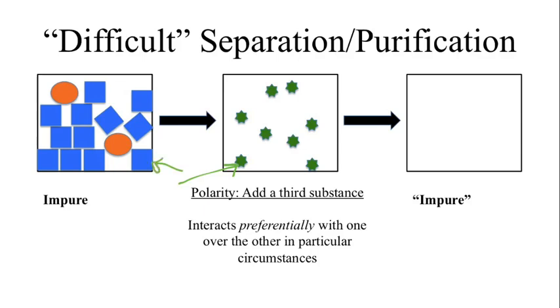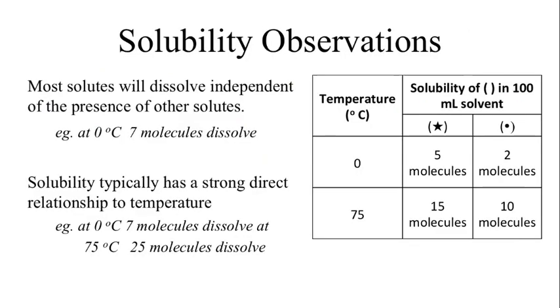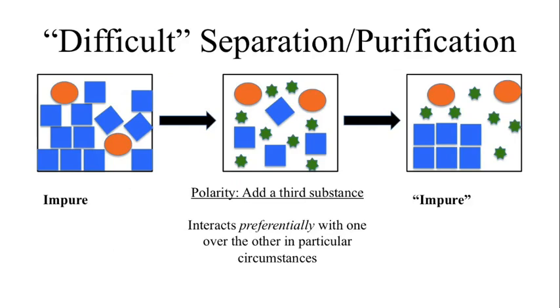Okay, so it's got to be able to come in and pull each of those molecules out away from each other entirely. Okay, once they're all separated, we then need to be able to somehow change our system such that our crystals form, and we end up again with that preferred state. Whoops, sorry. So that gets a bit tricky.